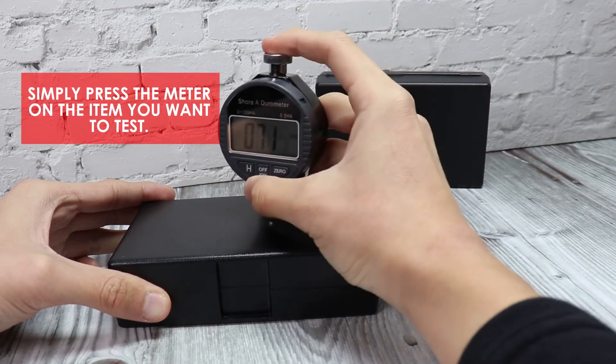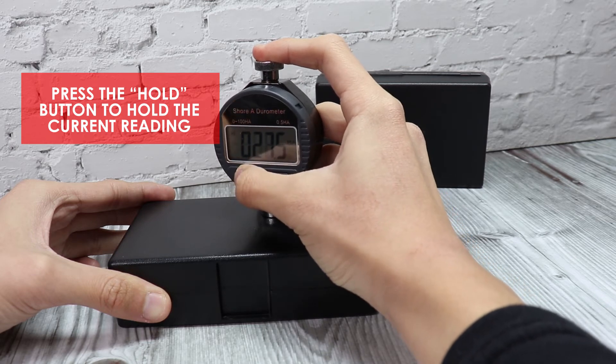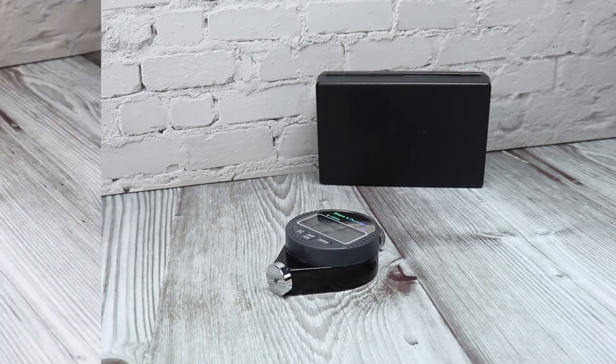To start measuring, simply press the meter on the item you want to test. Press the Hold button to hold the current reading. The H icon will display on the screen indicating that the data hold function is on. Press the Hold button again to disable the data hold function.